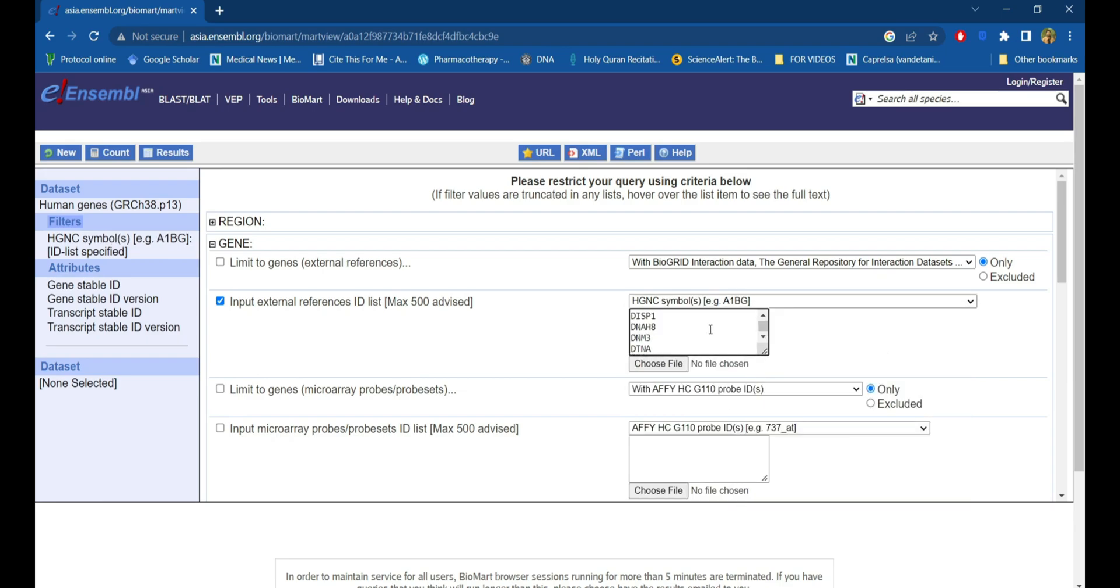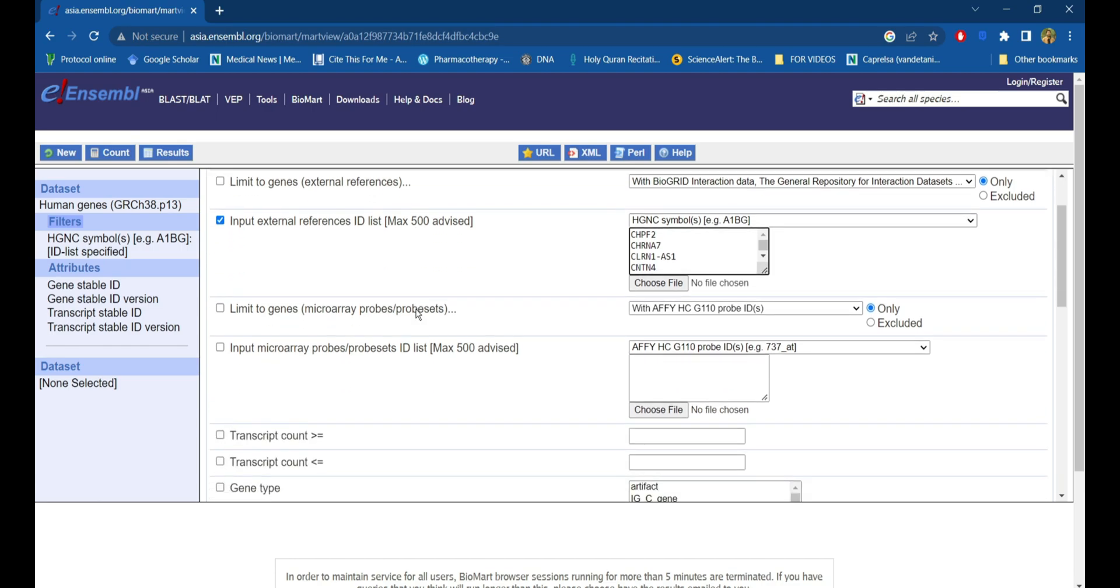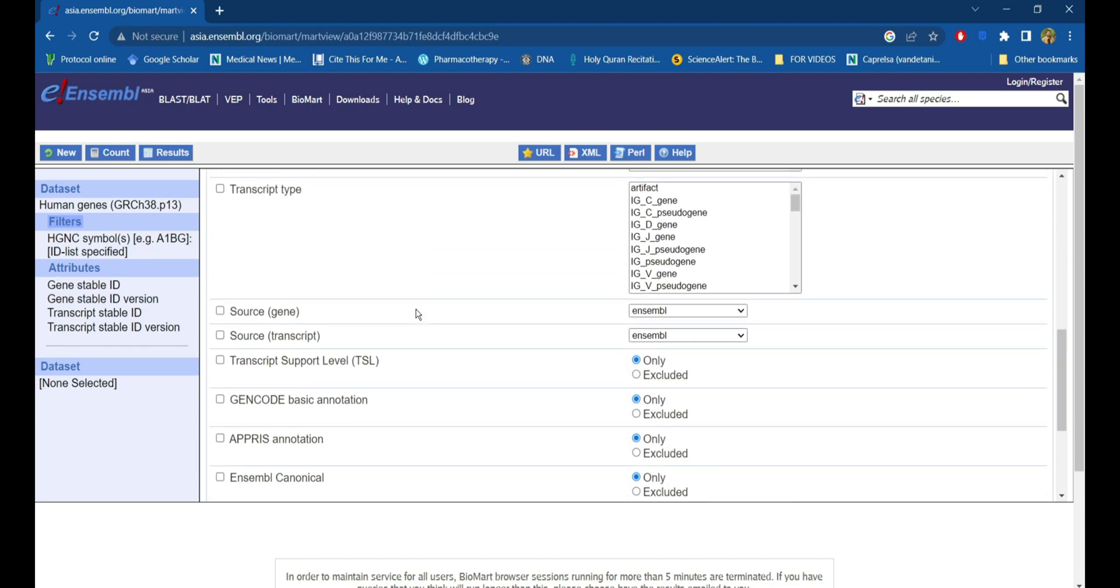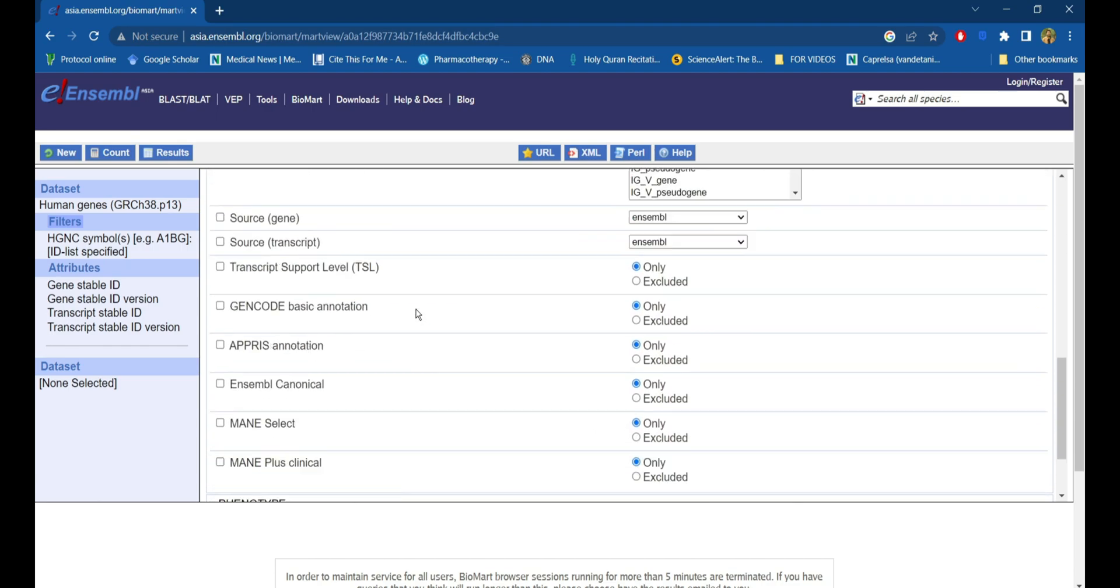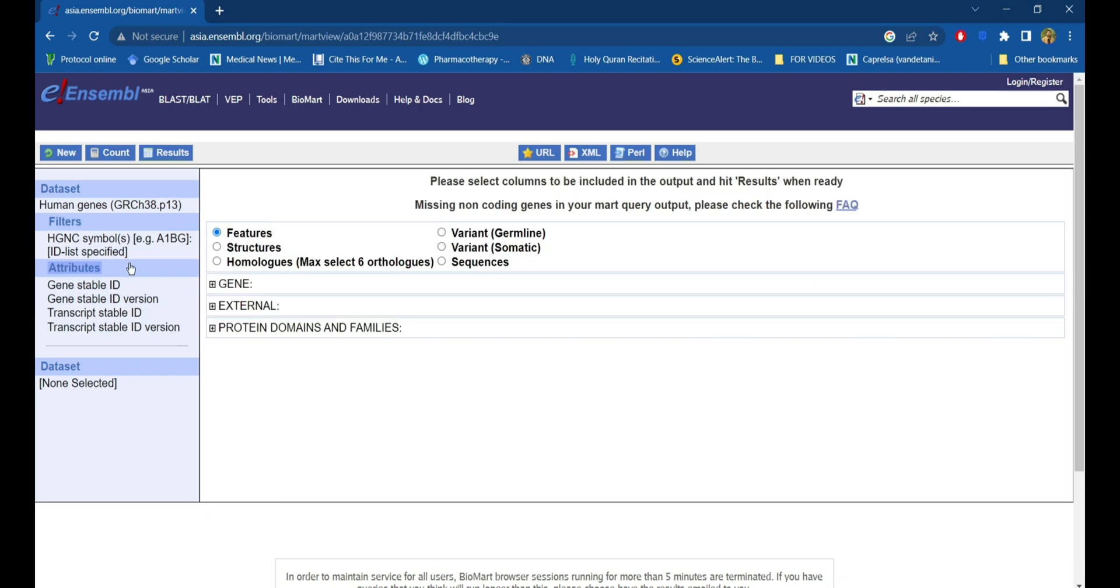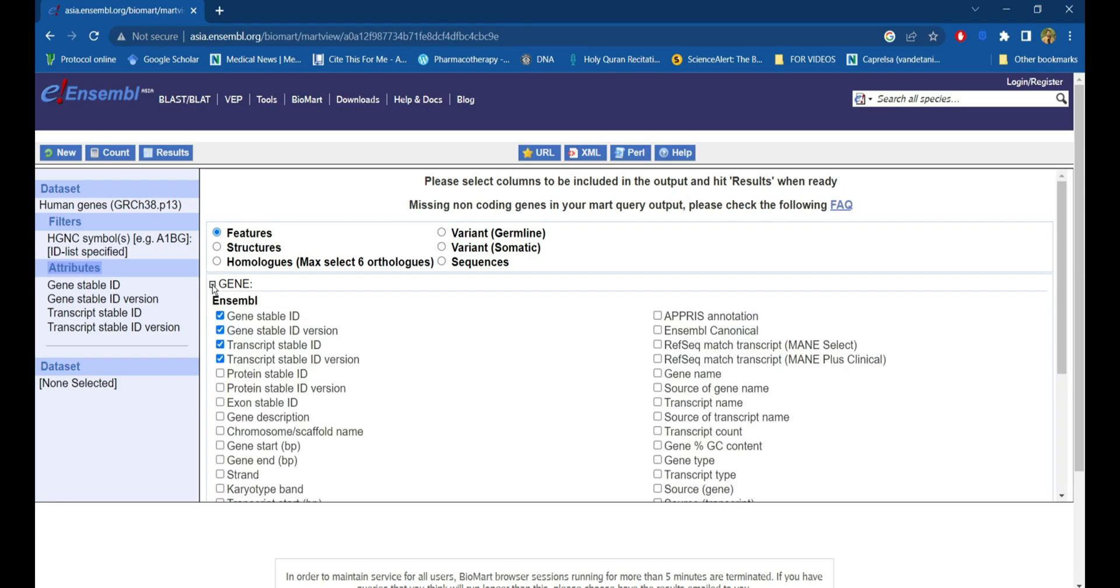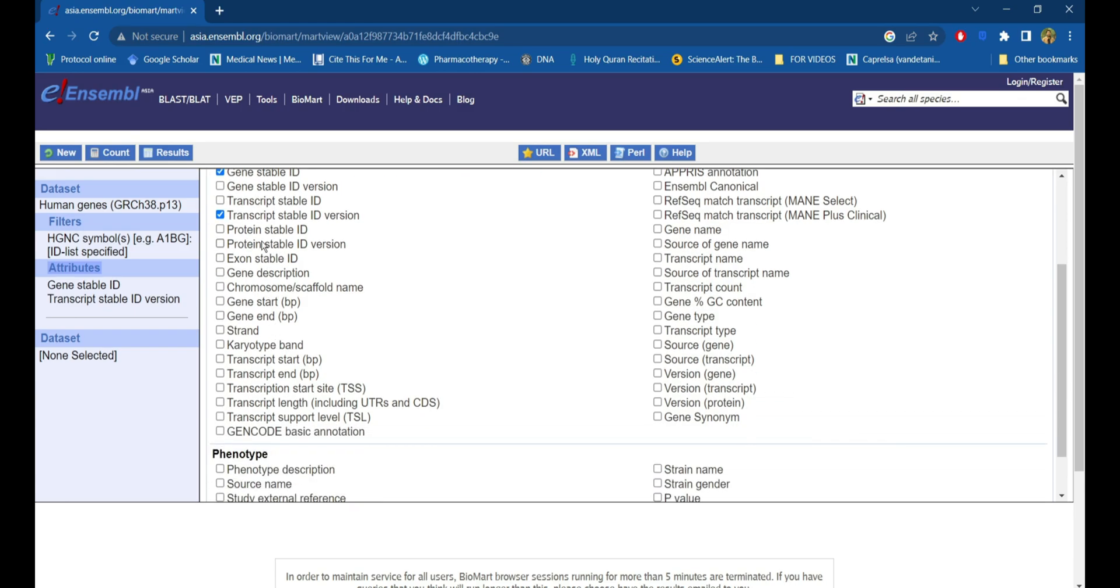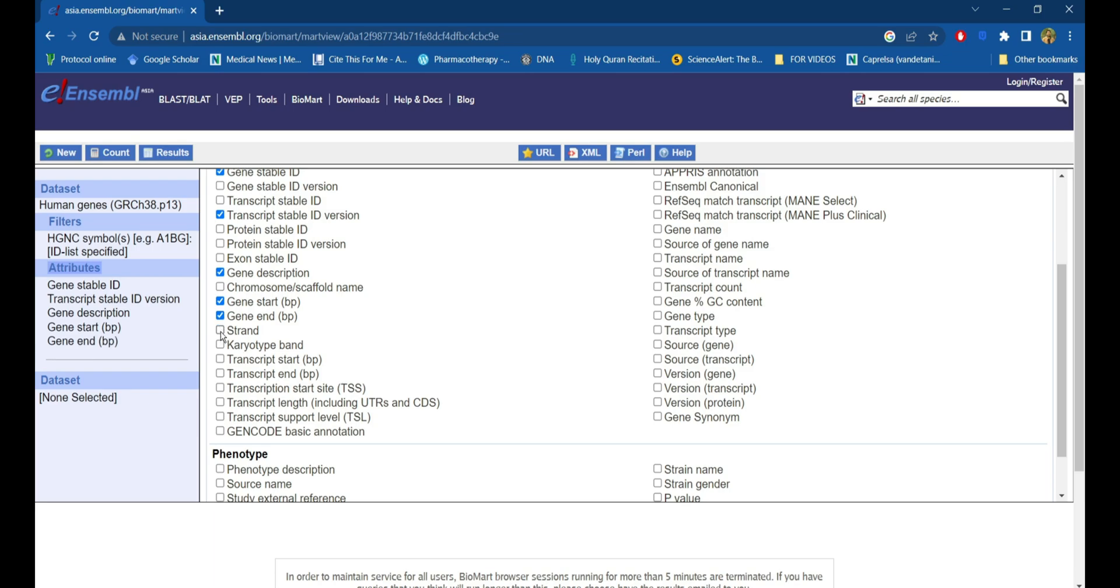Now click on the attributes in which we can select the required outputs of the genes. As we need the gene location, we will click on the gene. I would choose gene stable ID, transcript stable ID, gene description, gene start and end, the strand in which these genes reside, and gene synonyms.